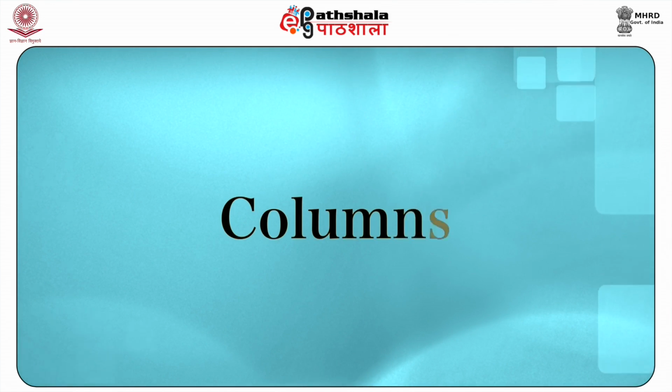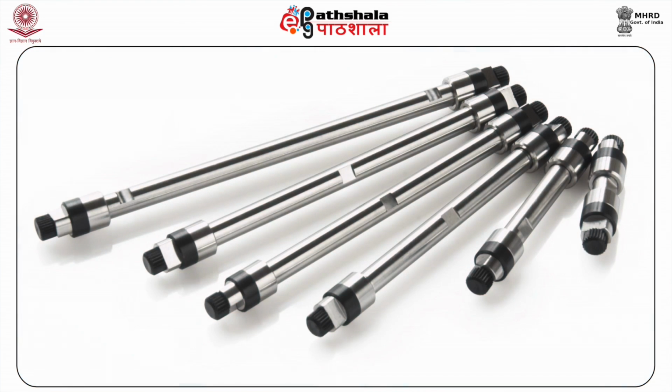It is desirable to have an integrated degassing system, either helium purging or vacuum degassing. Next are the columns. Typical LC columns are 10, 15 and 25 cm in length and are fitted with extremely small diameter particles, that is 3, 5 or 10 micrometers.